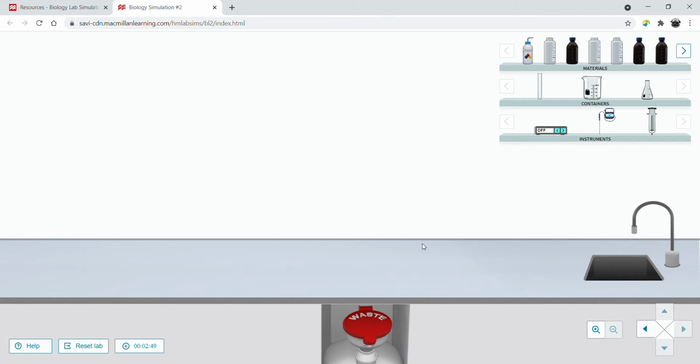Here we are at our lab bench. Let's go through it. You have your lab handout up. The first few pages just go through the different categories of those biological molecules, but it also goes through ways we can test for the presence of them. And so I'm going to go through those as well.